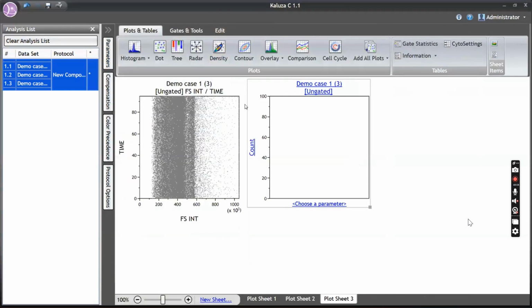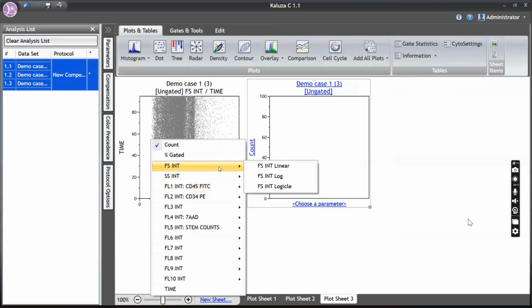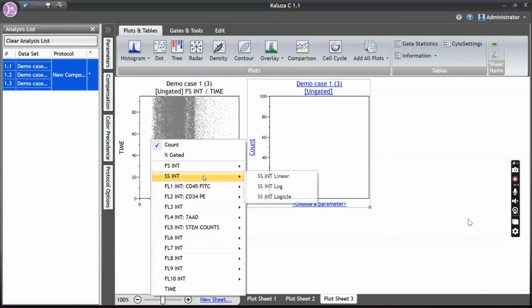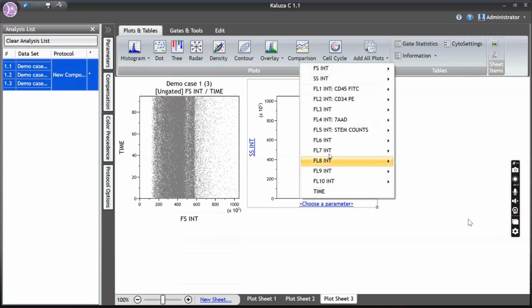The second plot is the singlet plot. You know, right? You need to do it with forward scatter area or integral versus forward scatter peak or height. Okay, so you get the singlets. Now, since it's not there, let's ignore. Then now we have to go for viability.